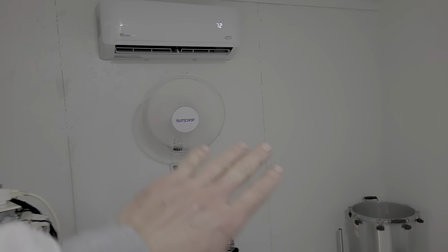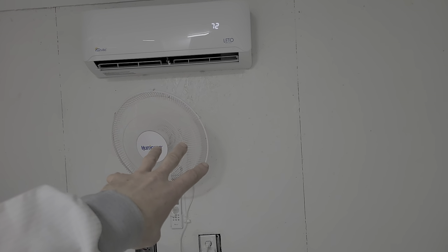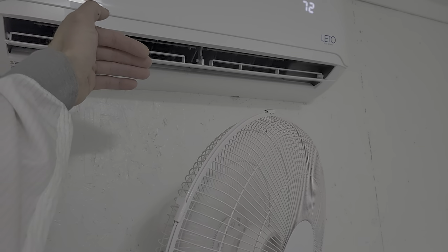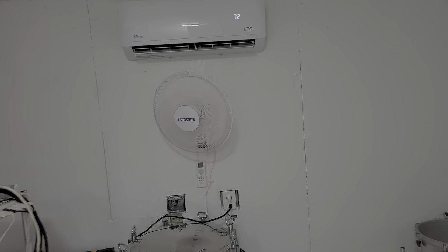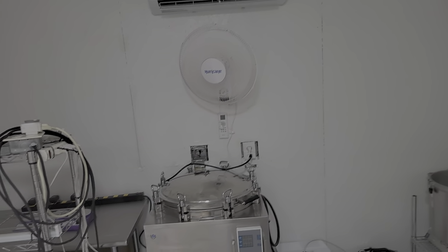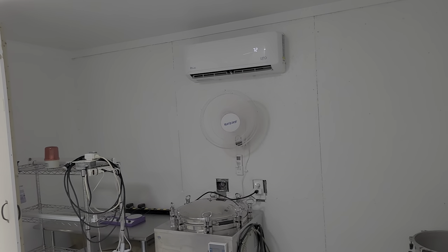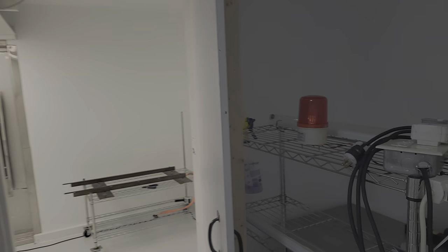In the incubation room I have my air conditioner. This is my favorite setup when using a ductless unit — a wall-mounted ductless AC with a fan underneath it. These units just trickle out right at the unit and don't distribute well, so adding the fan really blends the room air and circulates it more evenly. When you have a full incubation load you really need something like that. If I were doing it again I'd probably do a ducted unit with a trunk and diffusers, like I have in my other lab.